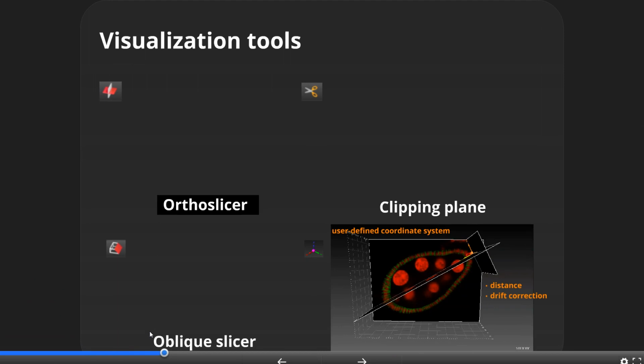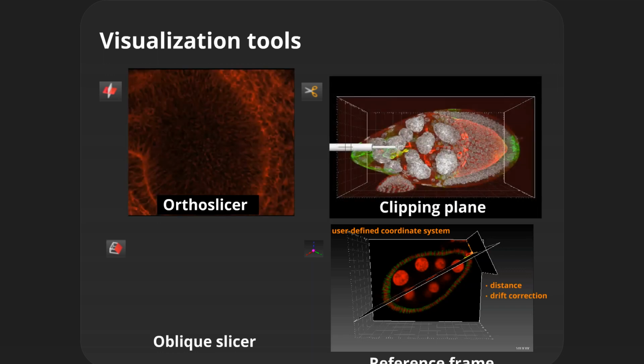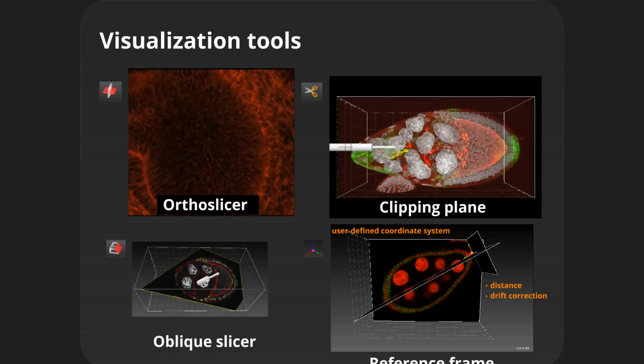Okay. I'm not going to spend a tremendous amount of time on this, but there are some other cool features where you can pretty much tell it's an Imaris movie the minute you see these features appear. So I'm going to just add these in so I can go through them with you. For those people who are working with thick, complex tissue sections, they can be some of the hardest data sets to visualize in 3D because they just look like a block of data. And it's hard to visualize, it's hard to present.